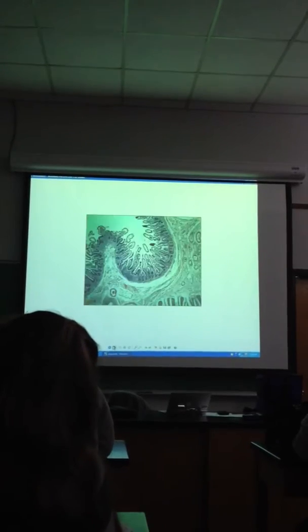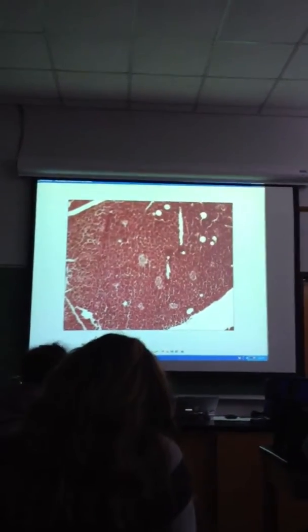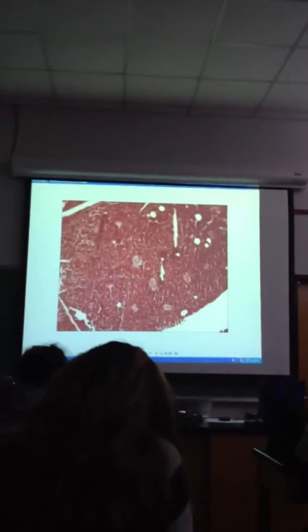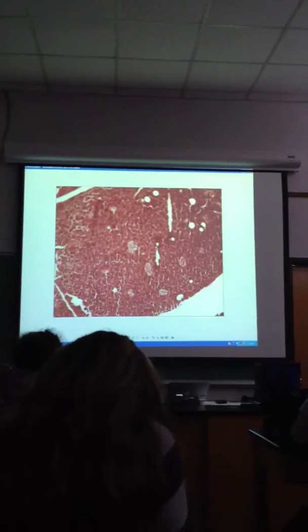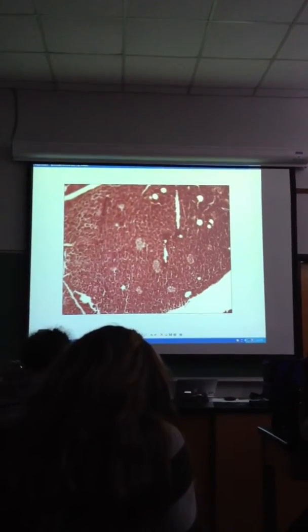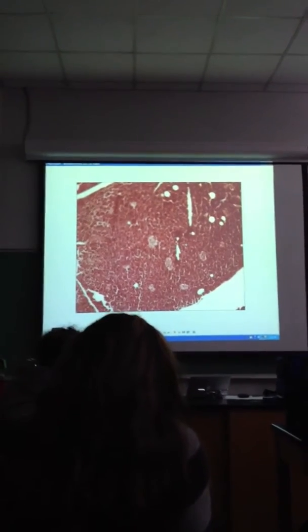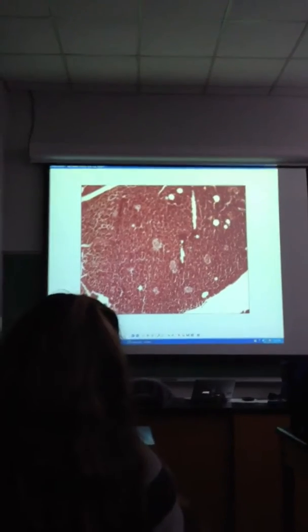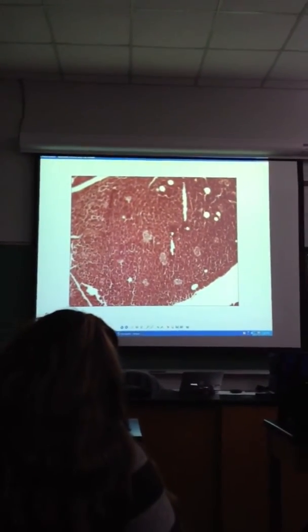Next, we want to take a quick look at the pancreas. The pancreas is the pancreas, the same one that you saw in the endocrine system. There we concentrate on the islets, but here we need to focus on the acini. The acini are all those cells responsible for making the enzymes like amylase, stuff like that. Okay, so this is where your digestive enzymes are coming from in the pancreas.